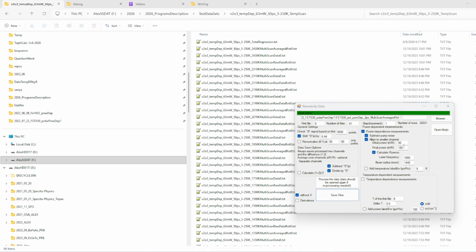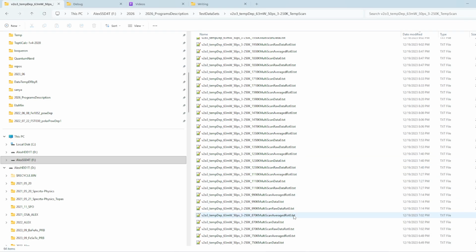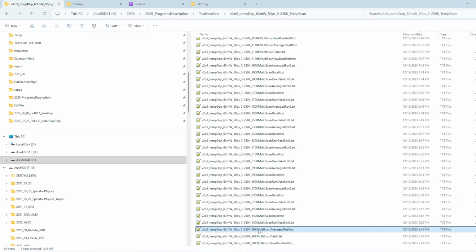In this video, I will show you how to use the Nematicity program for temperature-dependent measurements. The first step is to identify the files. They will be average rod files, and you need to identify the number of files.